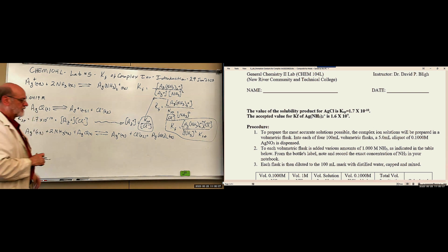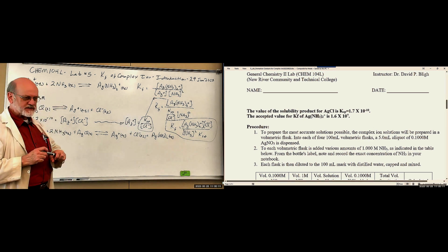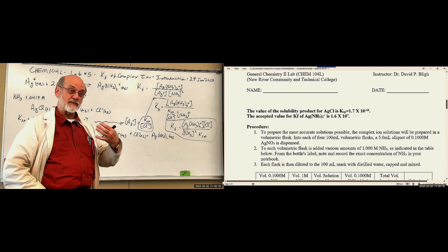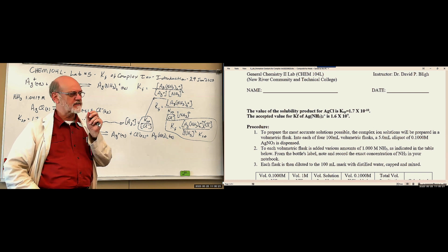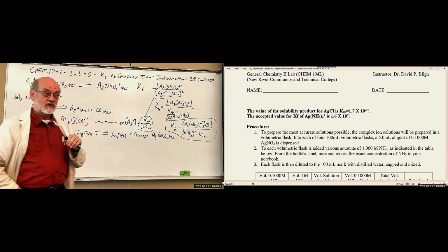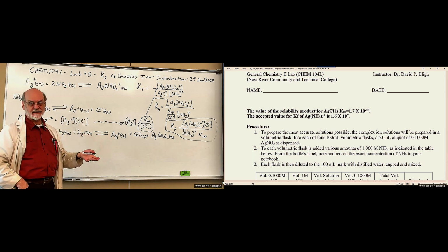That's the endpoint. When we do that, it's difficult to see, because silver chloride, when you form it as a precipitate, is a very small particle size. It's difficult to see, and they're kind of white, opalescent. So you'd have to go past the endpoint to see them in ambient light.